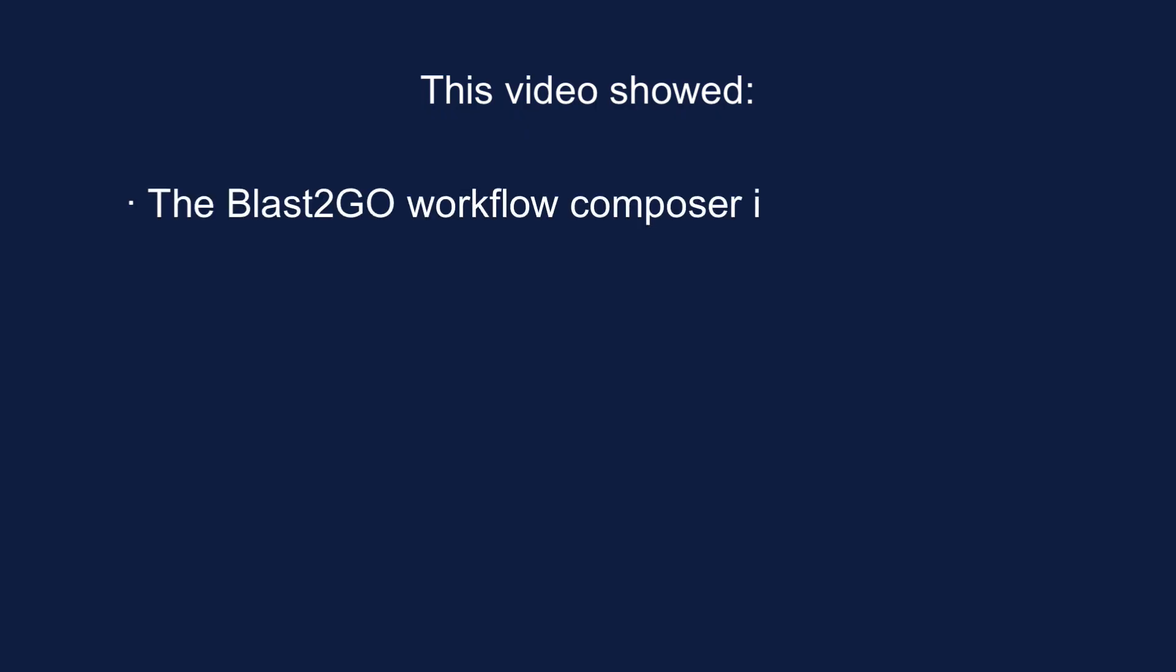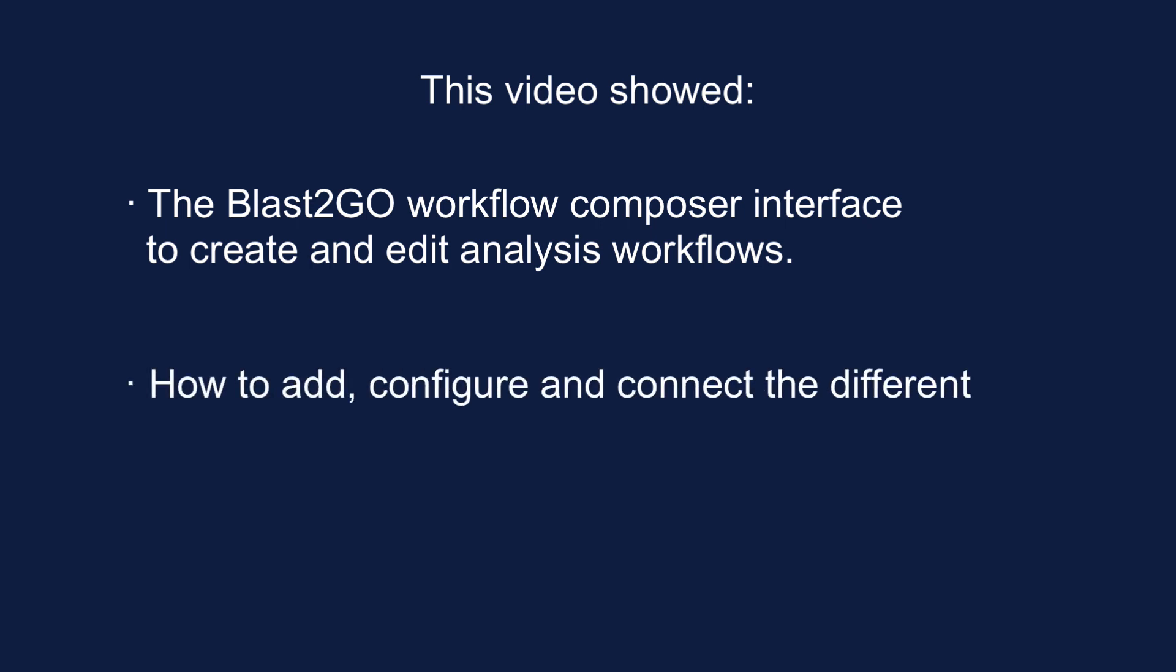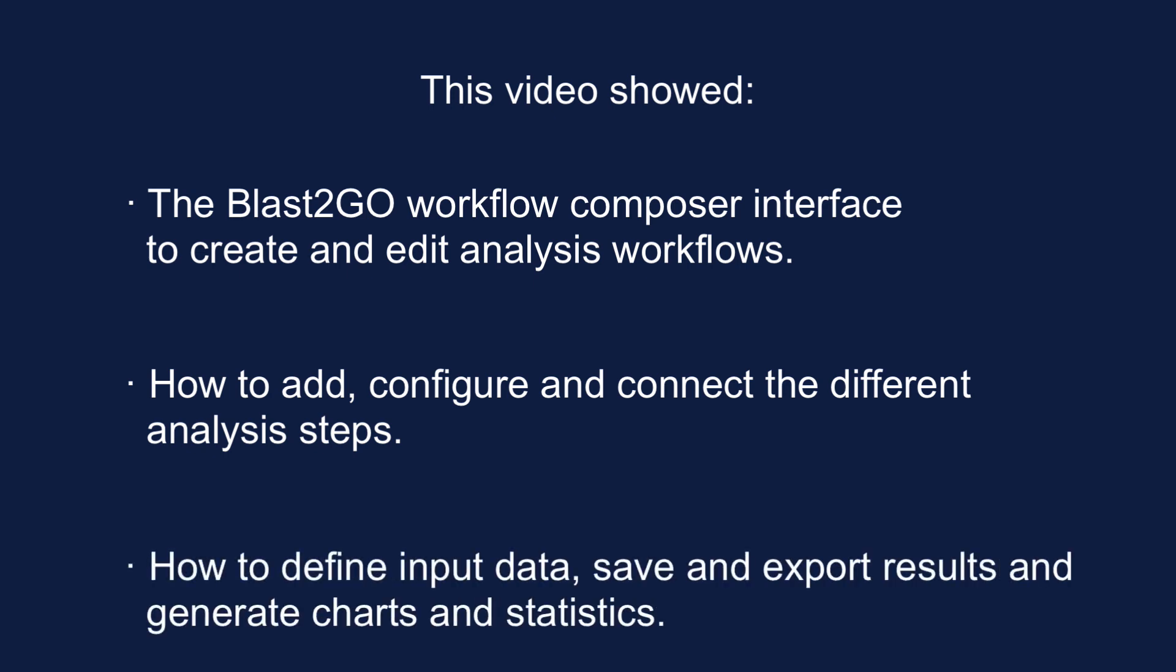This video has shown the Blast2Go workflow composer interface to create and edit analysis workflows, how to add, configure, and connect the different analysis steps, and how to define input data, save and export results, and generate charts and statistics.